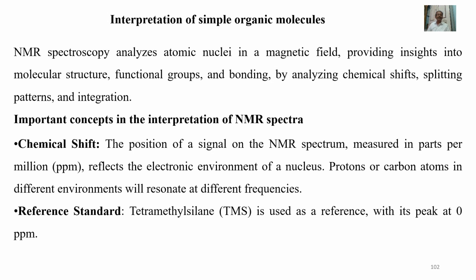Let us discuss interpretation of simple organic molecules from NMR spectra. Interpreting NMR spectra of simple organic molecules involves analyzing chemical shifts, integration, and splitting patterns to deduce structural information, including the types and numbers of protons and carbons present, as well as their connectivity.